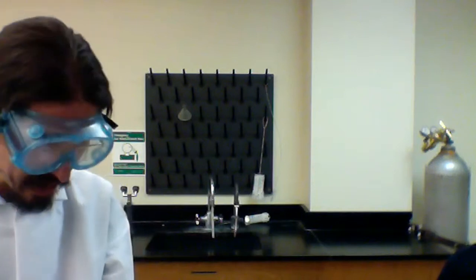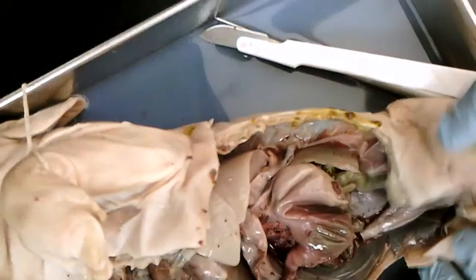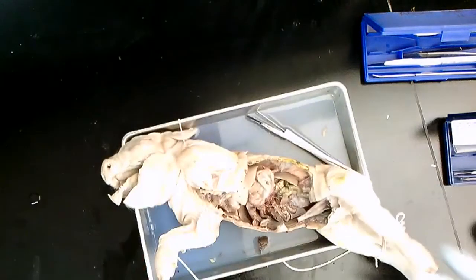So do you have any questions about the dissection? I could take this further out if you would like me to. I would highly suggest your students doing that, and it's going to help them identify. Anything that people would like to take a closer look at, or questions you have?